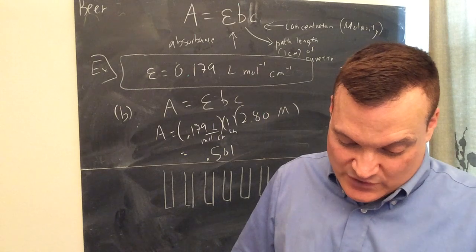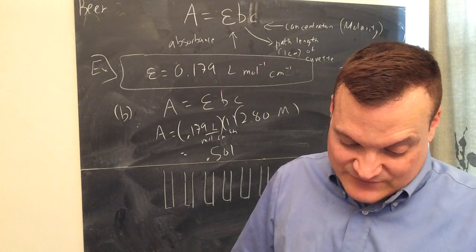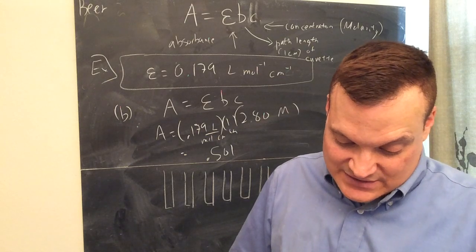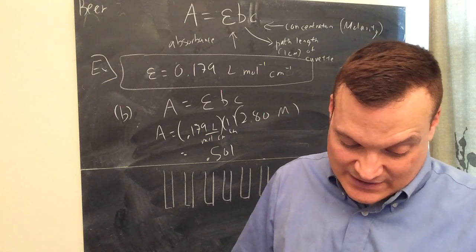Transfer 1 milliliter of 0.01 to test tube number 1. Add 5 milliliters. Transfer 1 milliliter of that to test tube 2. Add 5 milliliters by vortexing.